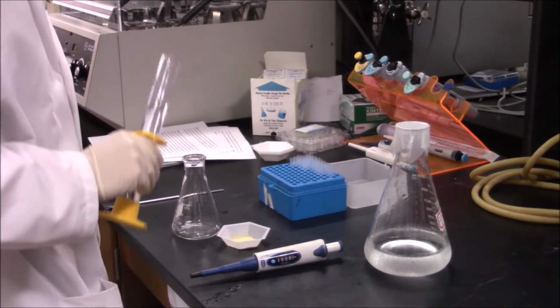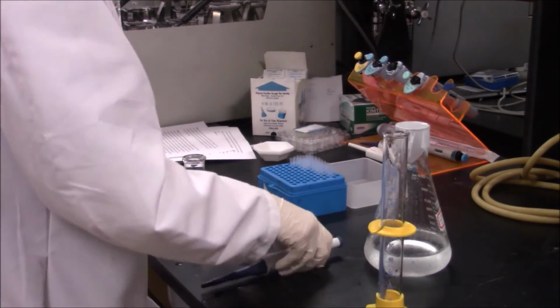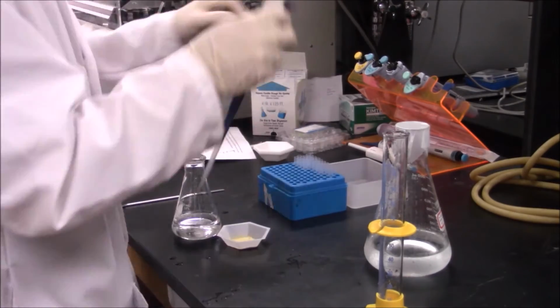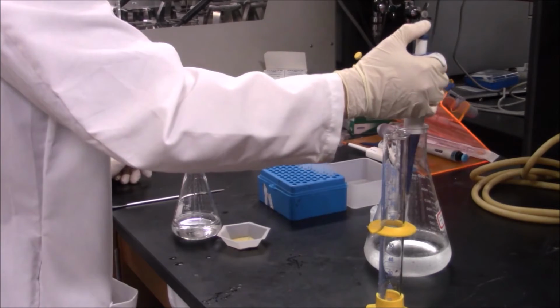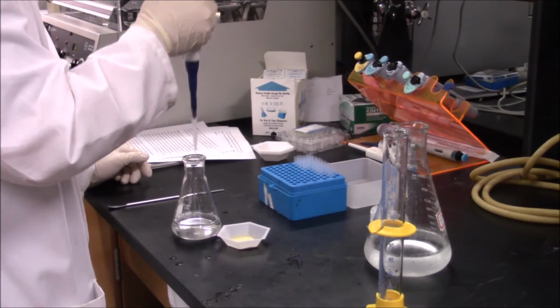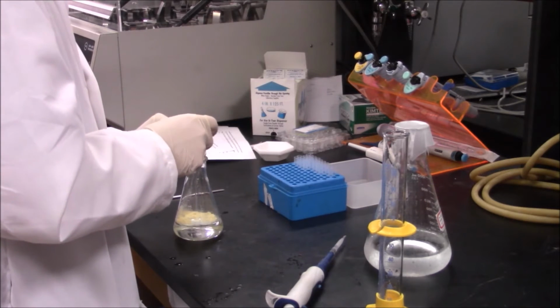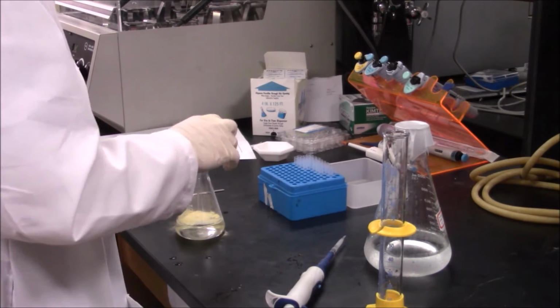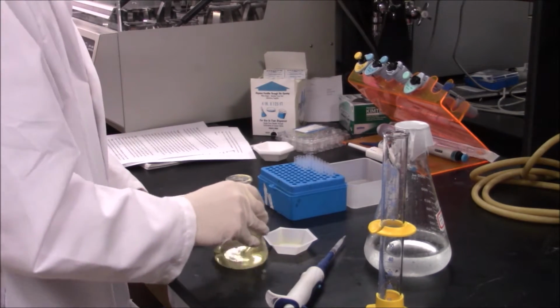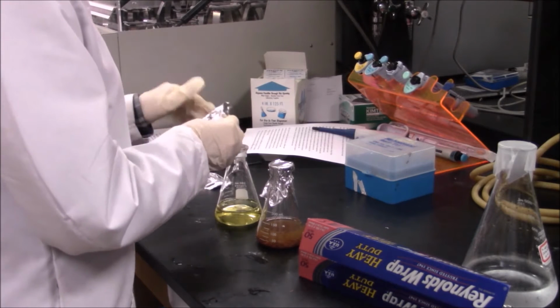A control solution containing 95 milliliters of distilled water, 5 milliliters of sodium citrate buffer, and 1 gram of yeast extract should be prepared in another 250 milliliter Erlenmeyer flask. This is done to isolate and observe the effects of the independent variable, the pre-treated aspen wood chips. Throughout the experiment, you should observe that no carbon dioxide is being produced, as no glucose is present for the yeast to consume in the control flask. Cover the tops of both flasks with aluminum foil in preparation for the next step.